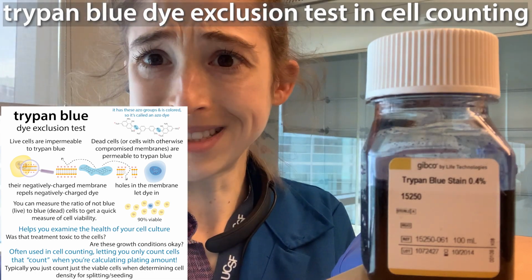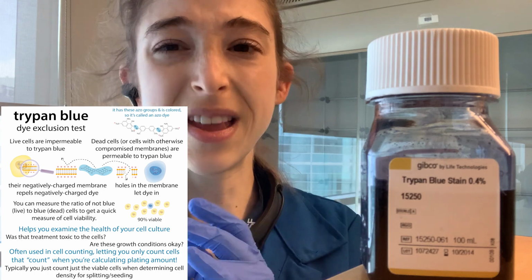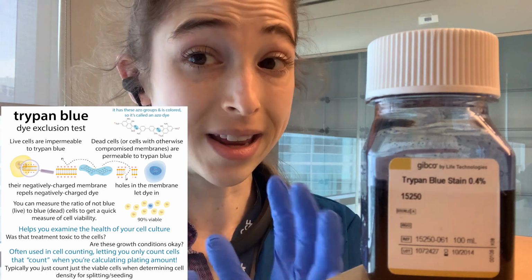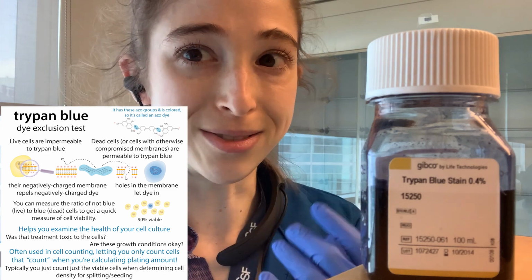Trypan blue? What does it do? It enters dead, but not living, cells and shows them to you. It also, fun fact, kills trypanosomes, and hence the name. But we're more typically using it in the cell counting game.